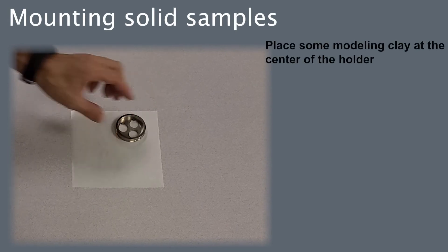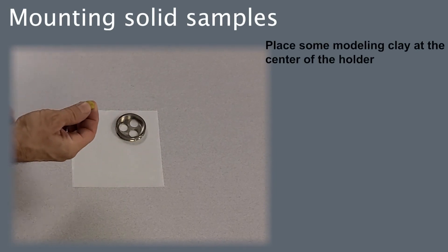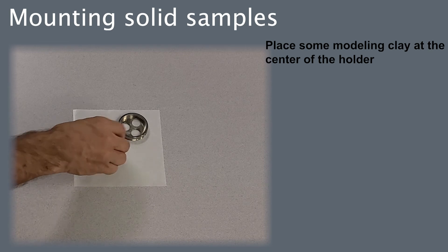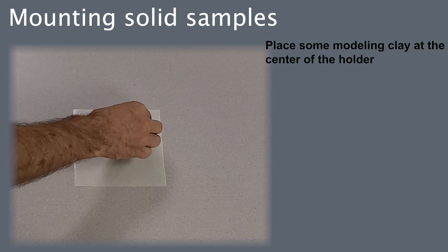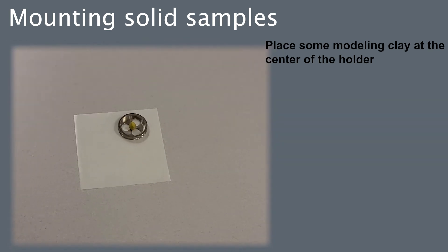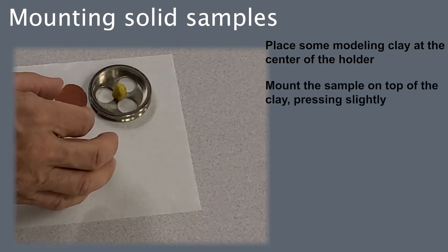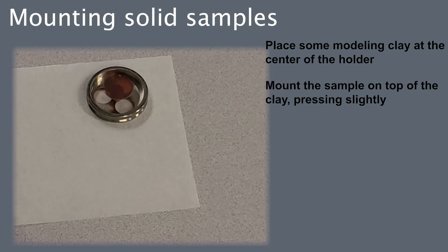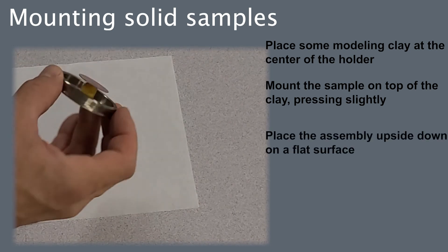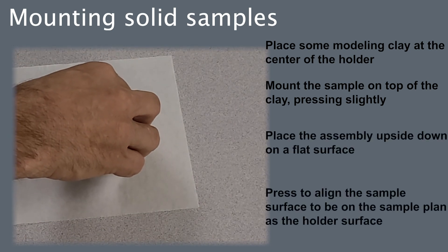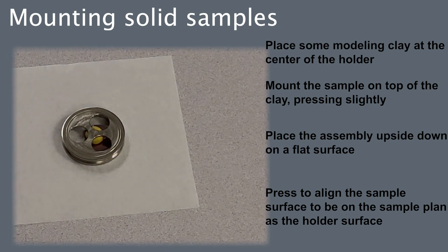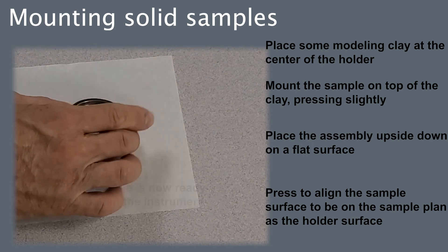Mounting solid samples. Place some modeling clay at the center of the holder. Mount the sample on top of the clay, pressing slightly. Place the assembly upside down on a flat surface. Press the assembly until the sample surface is in the same plane as the holder surface. The sample is now ready to load in the instrument.